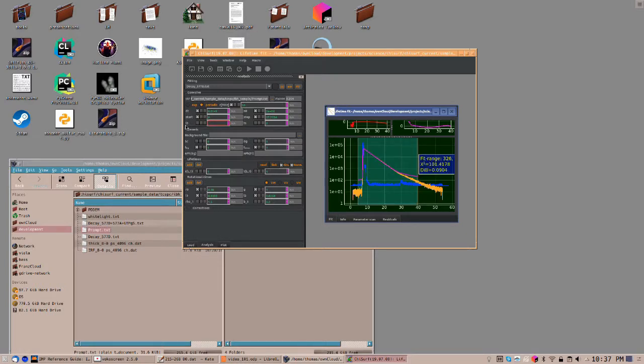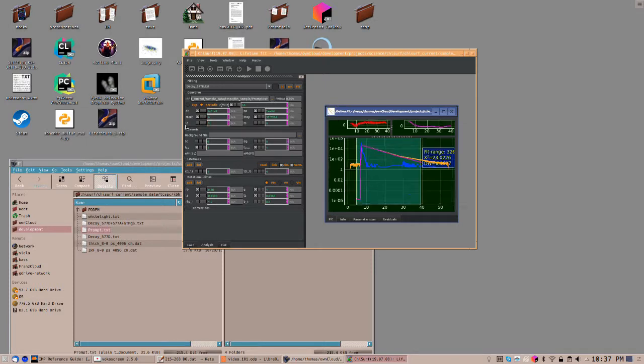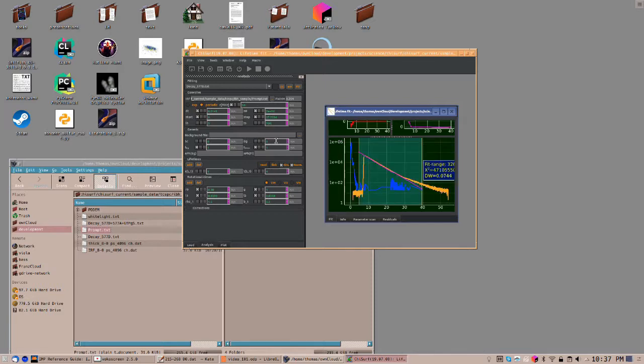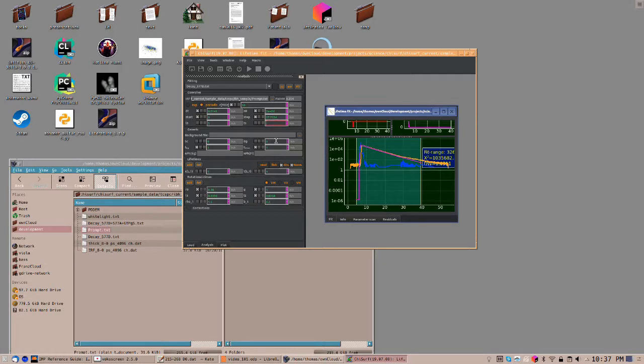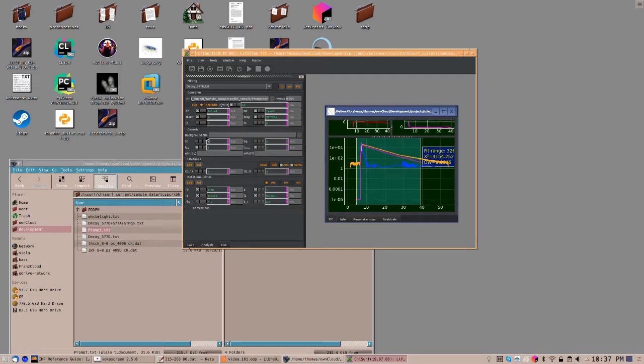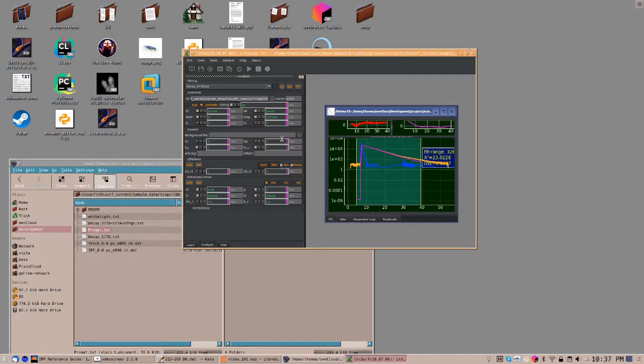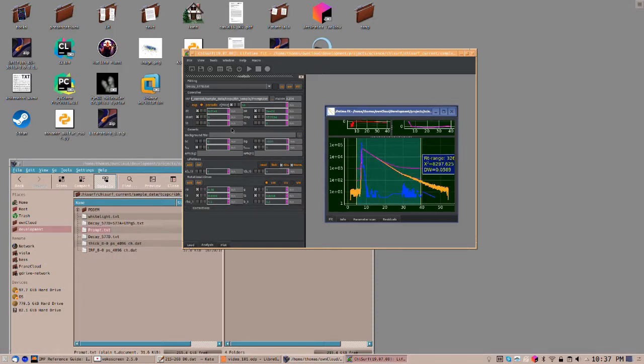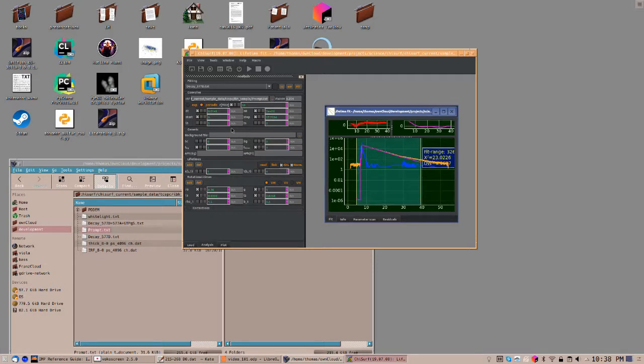Usually, only positive values make sense. TS refers to the time shift of the instrument response function. SC refers to the scattered light. BG refers to the background, a constant offset.